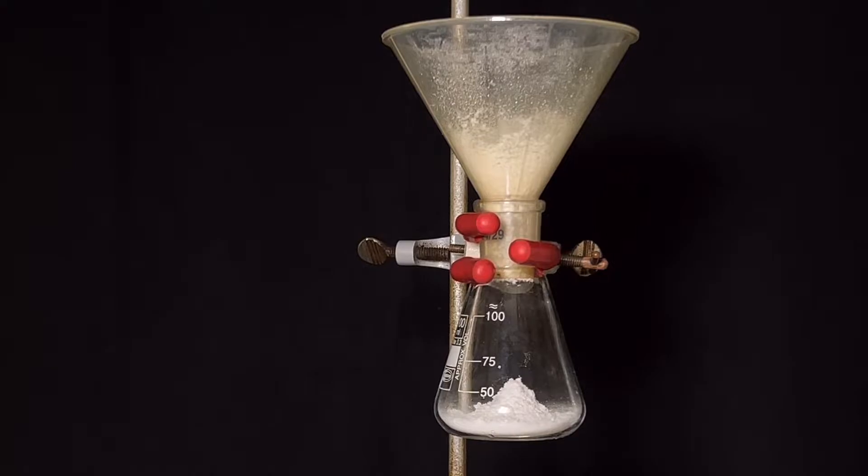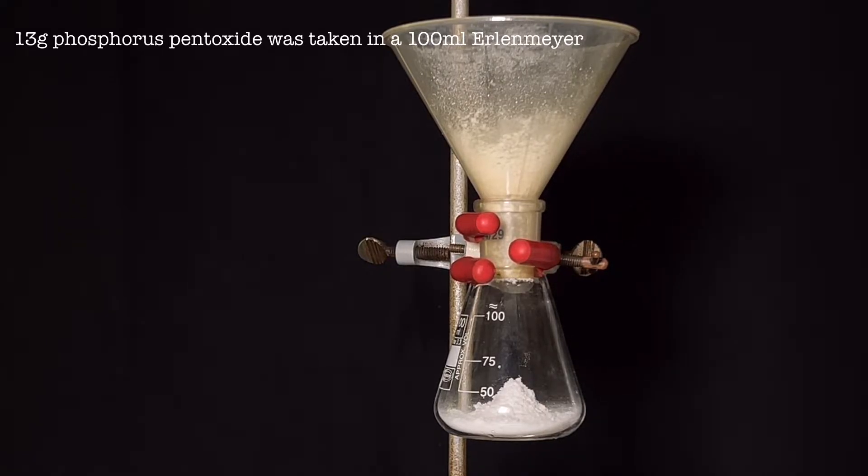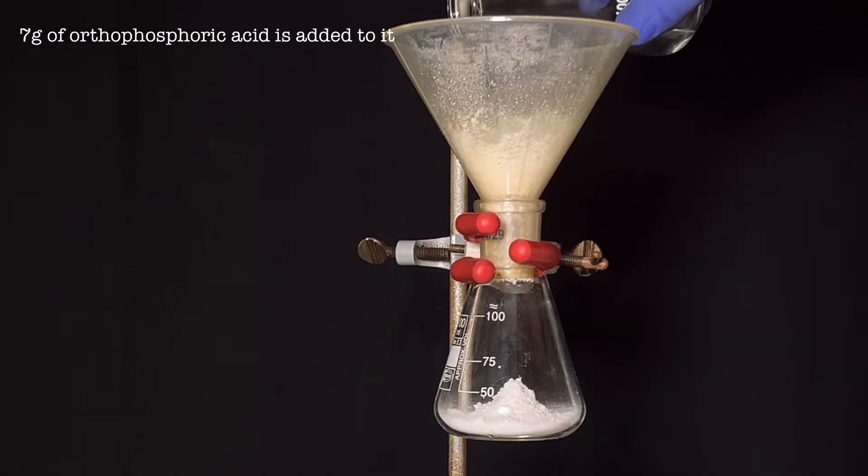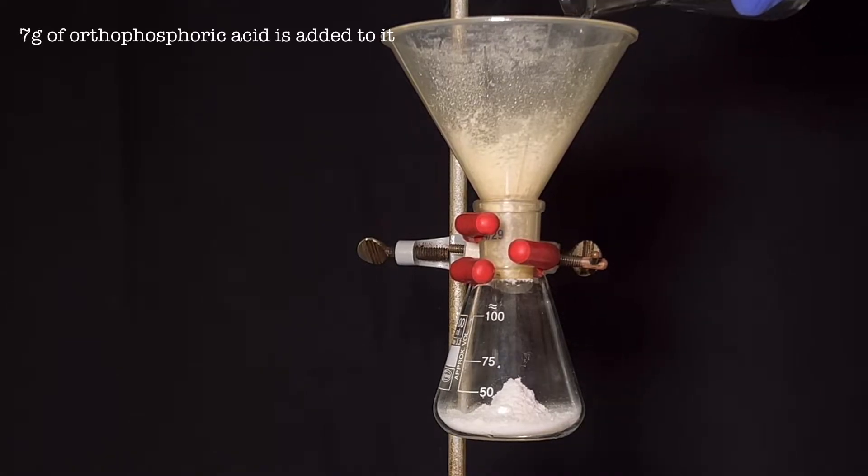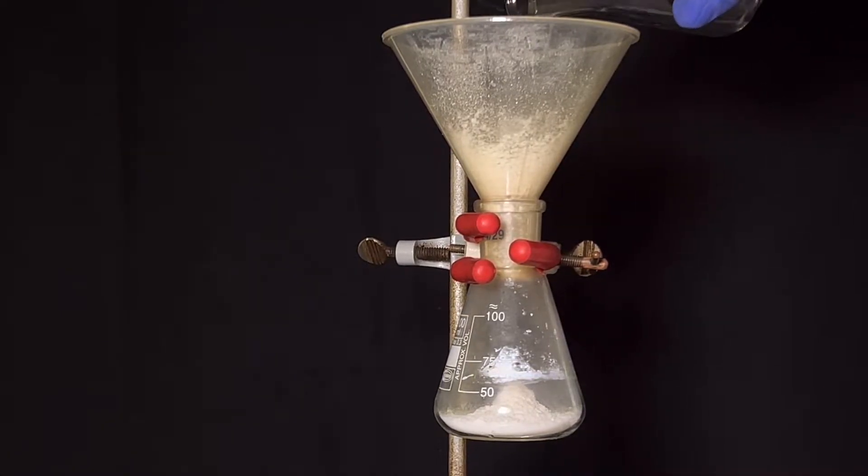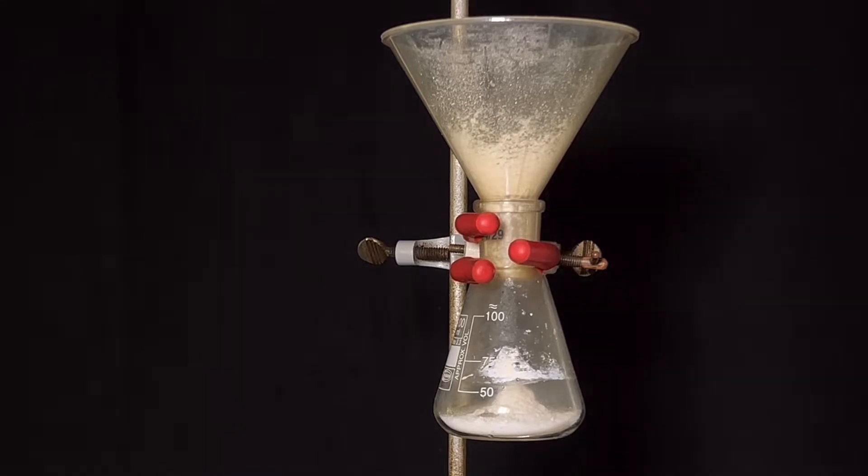Once that is under vacuum, we will move with the preparation of the polyphosphoric acid. For that, 13 grams of phosphorus pentoxide was quickly transferred to a 100 milliliter Erlenmeyer flask using a funnel. Then 7 grams of orthophosphoric acid is added to it. The phosphoric acid was added in a circular manner to wash down everything to the flask.